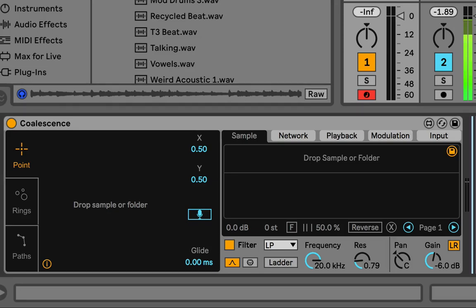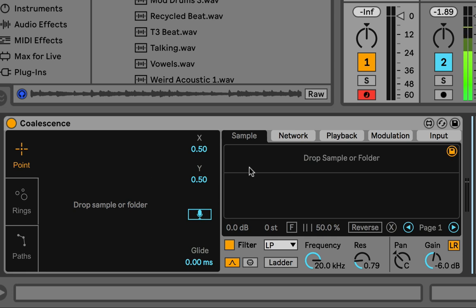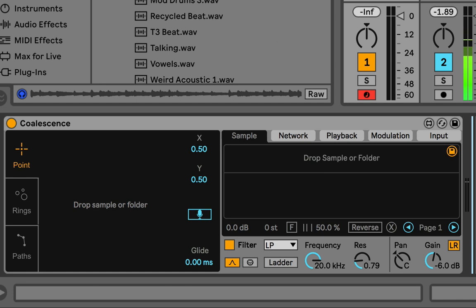Hi all. In this video I'm going to do a more deep dive into the neural network of Coalescence, training it, and I'll also touch on the sample analysis too. This is just to clear any questions and give nuances.